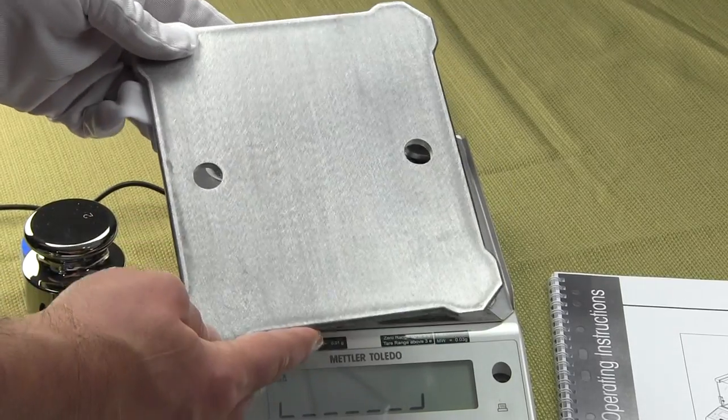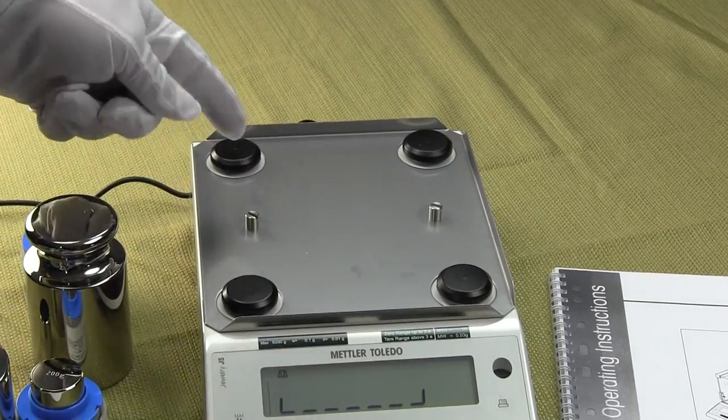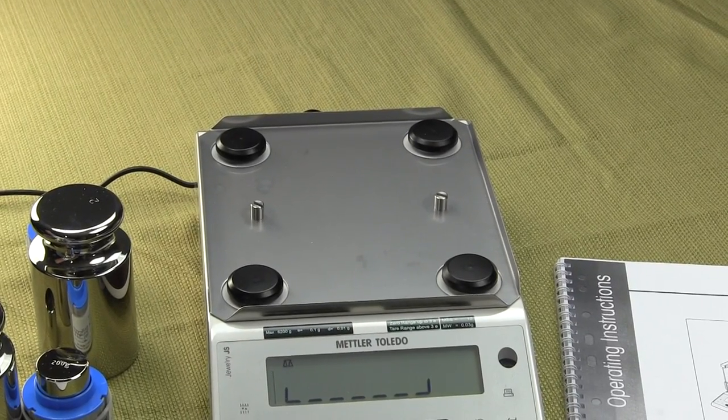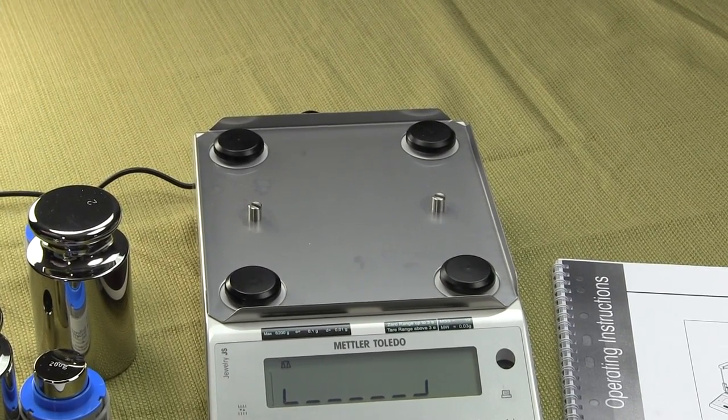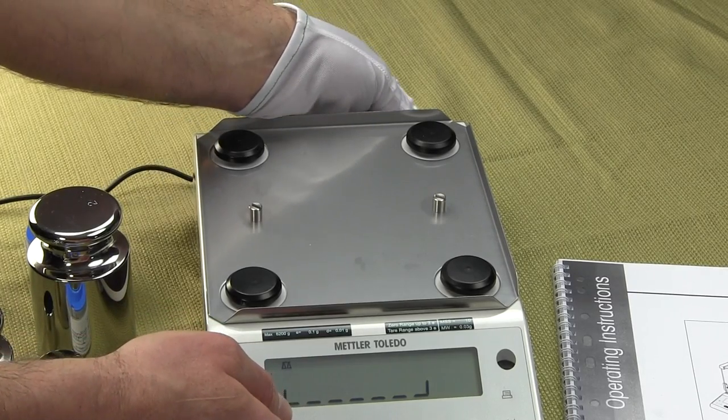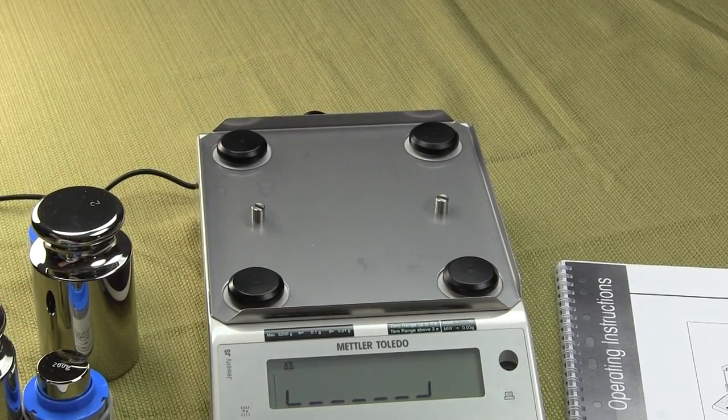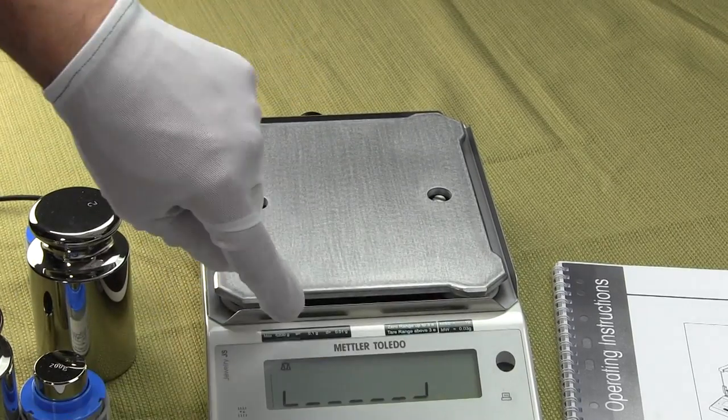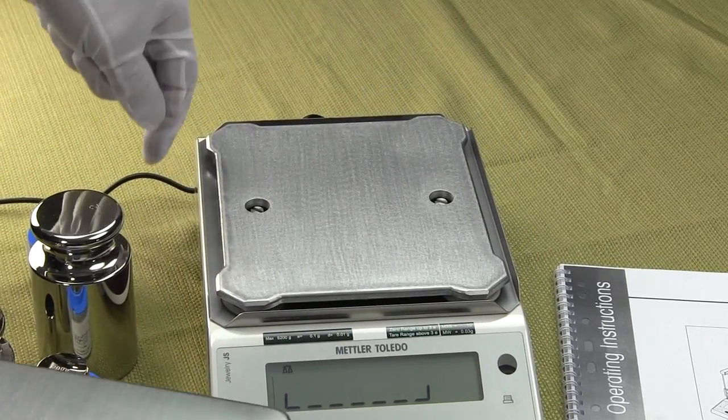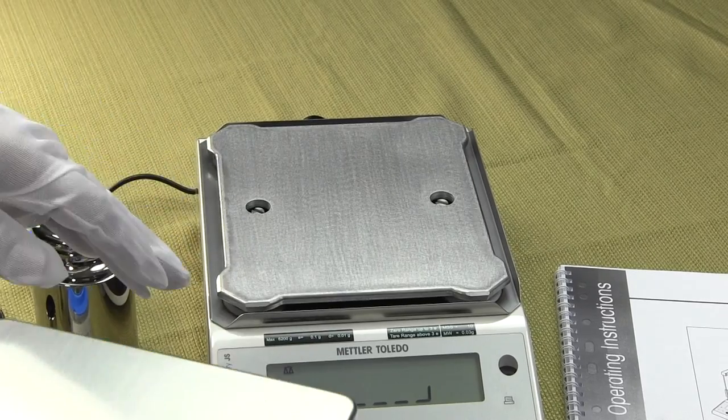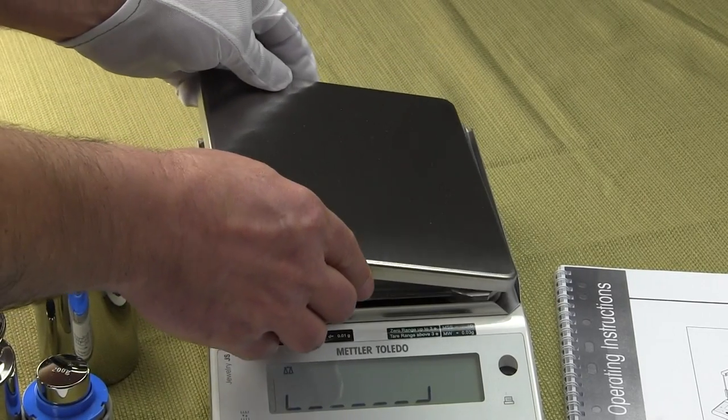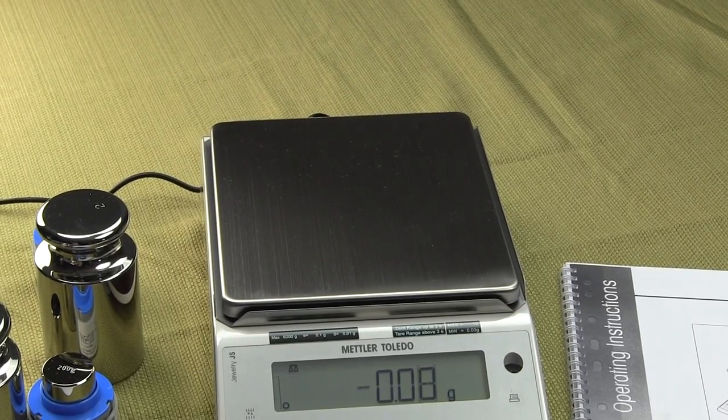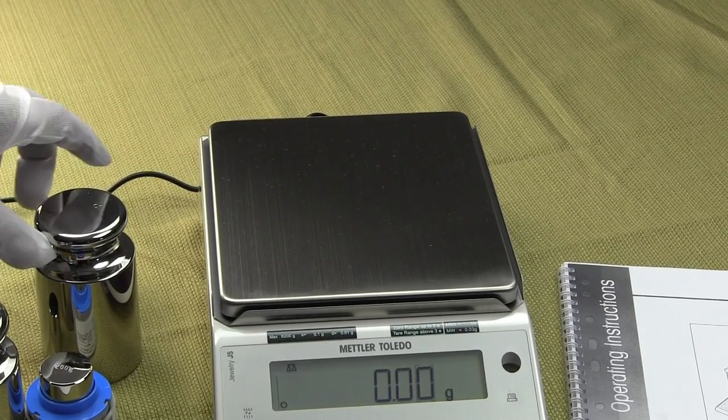This is your pan support and you'll notice you have your four spiders here that transfer the weight. Let me go over some of the features on the balance itself. This here is what they call a windshield. It prevents any air from going underneath the platform and allows the balance to be within its tolerance. The balance is pretty simple to use.